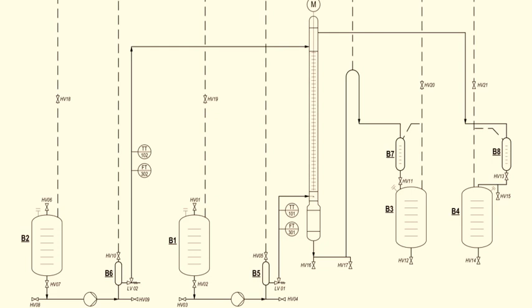The unit also has two pumps, P1 and P2. These are dosing pumps operated at 0.022 kilowatt piston pumps, and they can handle up to 42 liters per hour capacity. The pumps are needed to pump the feeds from vessels B2 and B1 into the column.